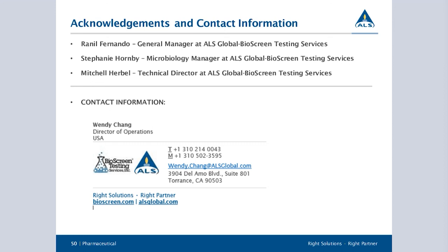We do have one question that just came in. It says, is the bile-tolerant gram-negative bacteria test mandatory for OTC products like sunscreen? As of right now, on the OTC side, it does not appear so, but I would recommend it because of the nature of gram-negatives. Sunscreen generally would have water in it, so I would recommend testing for it.